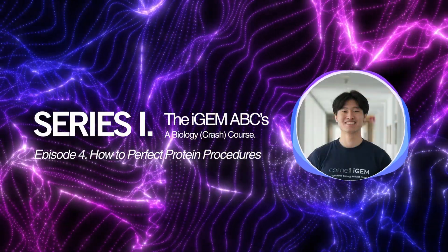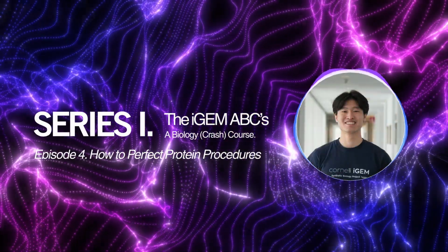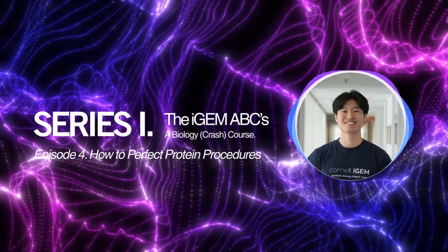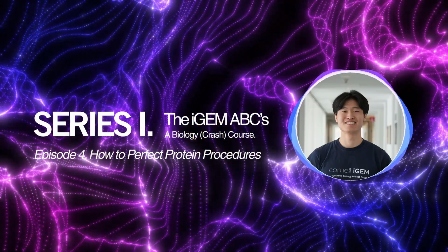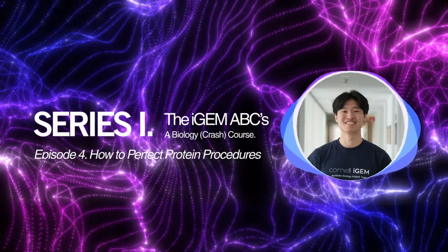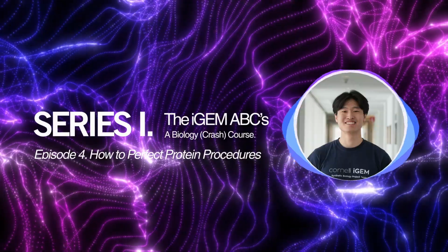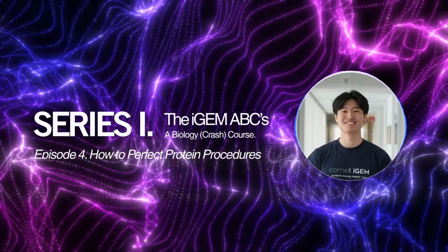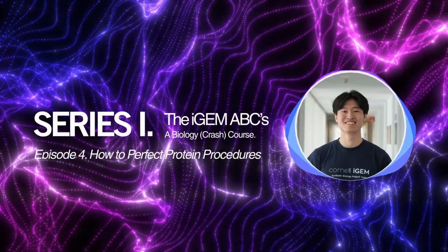So an assay is basically just any test where you can determine the effect of the protein, whether it's through the formation of a product or a color change through a colorimetric assay. There's a whole suite of assays and tests that you can use, while functional tests refer to just the action of testing the function and the catalytic effect of an enzyme. So one thing we want to look for is enzyme activity.